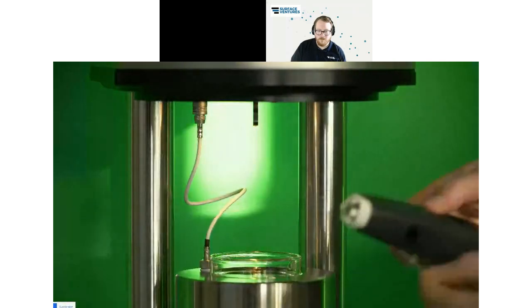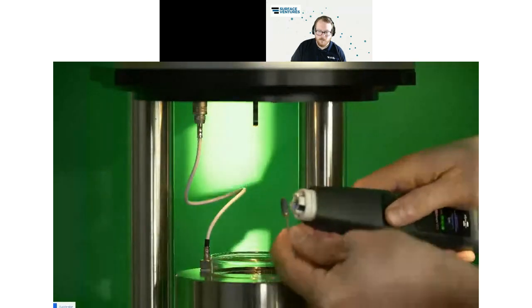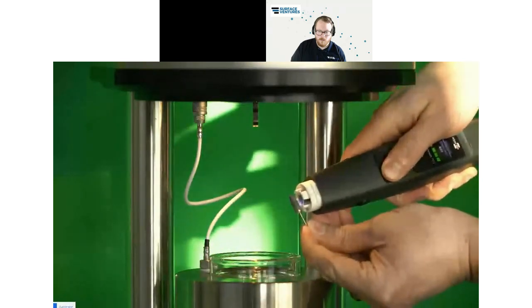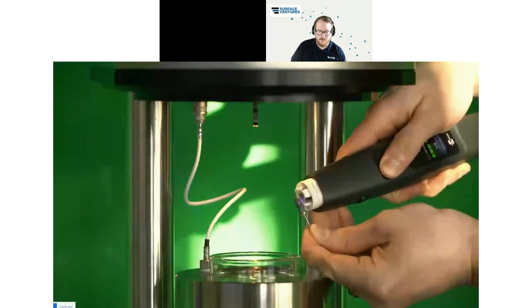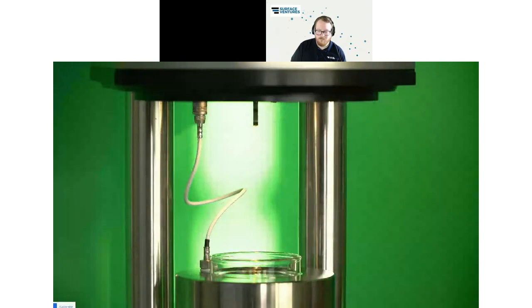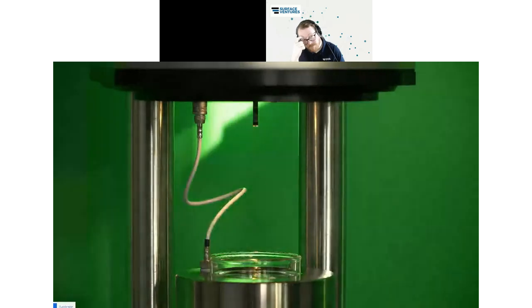So I hope we get it also sharp. I hope you see this a little bit, that blue light is jumping over and we are treating the implant surface with plasma. During this plasma treatment process, the surface is activated and it's becoming more and more polar.